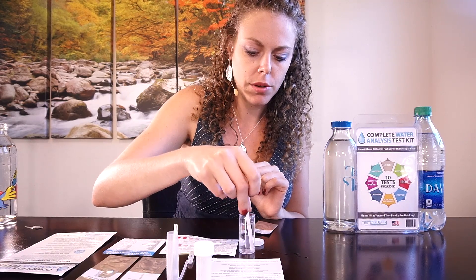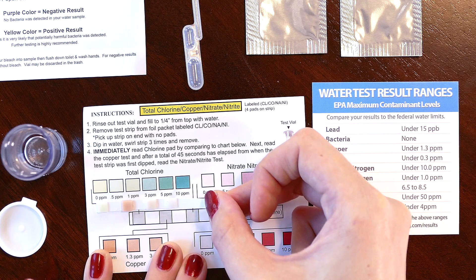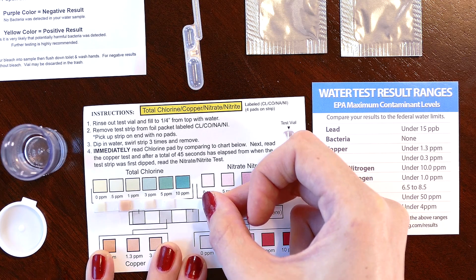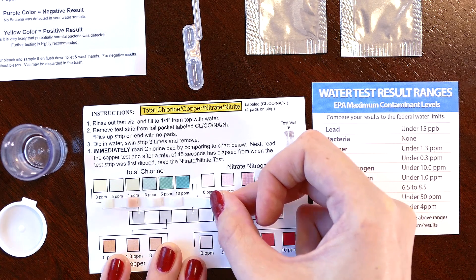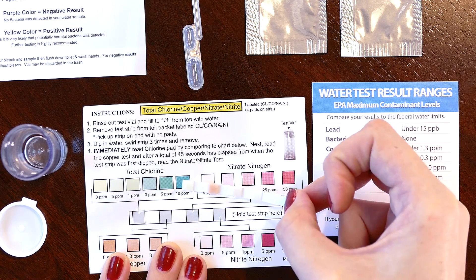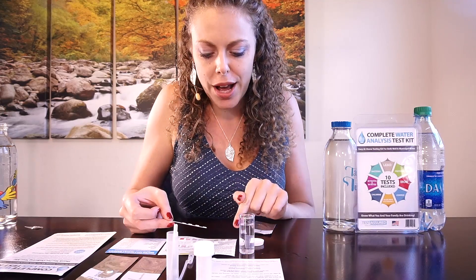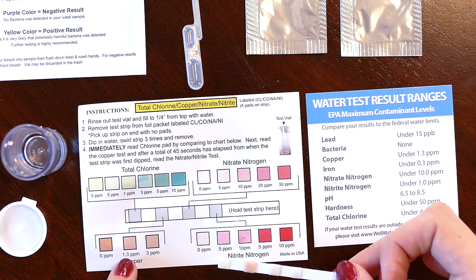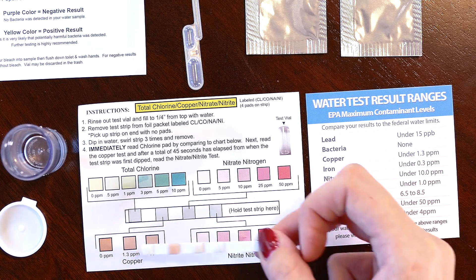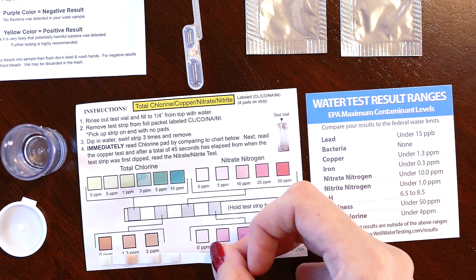This is really cool. We hold up the strip to these various colors to determine the amount. So this far end is the chlorine strip. Next we're going to do the copper test — that's the second strip on the chart.